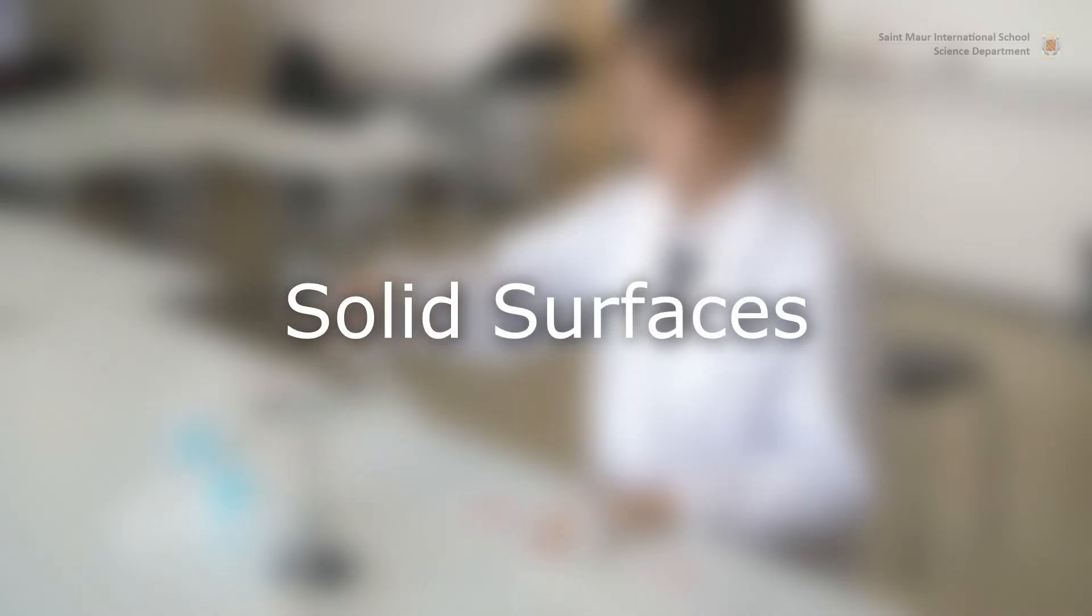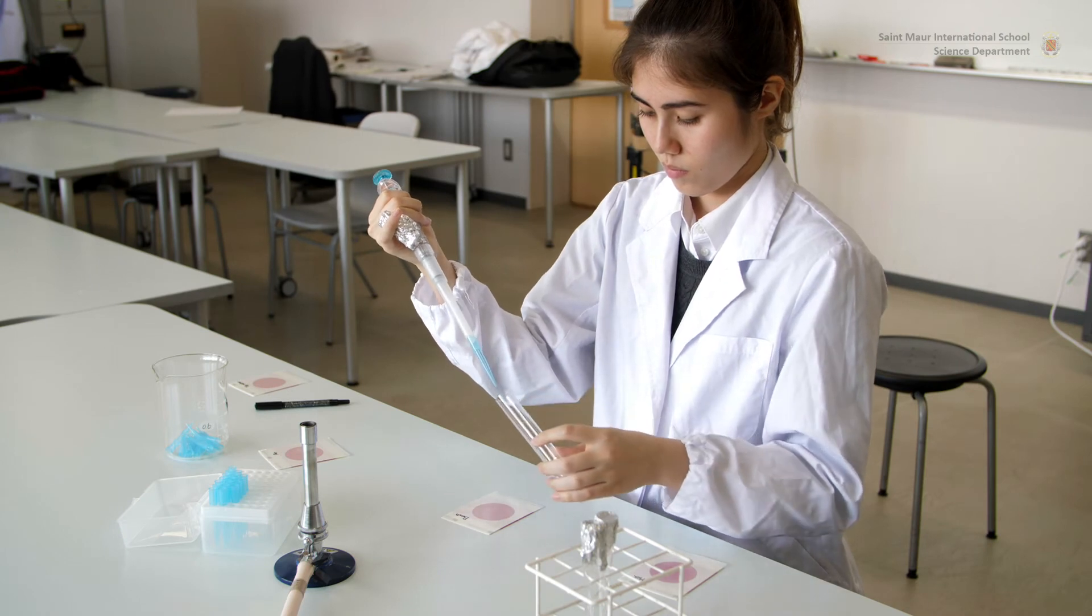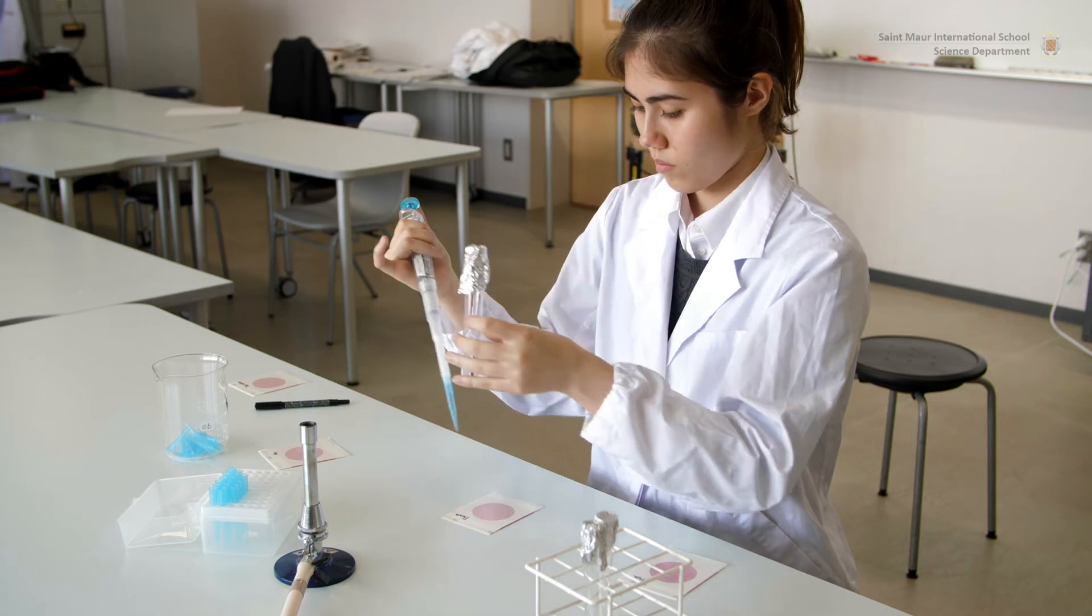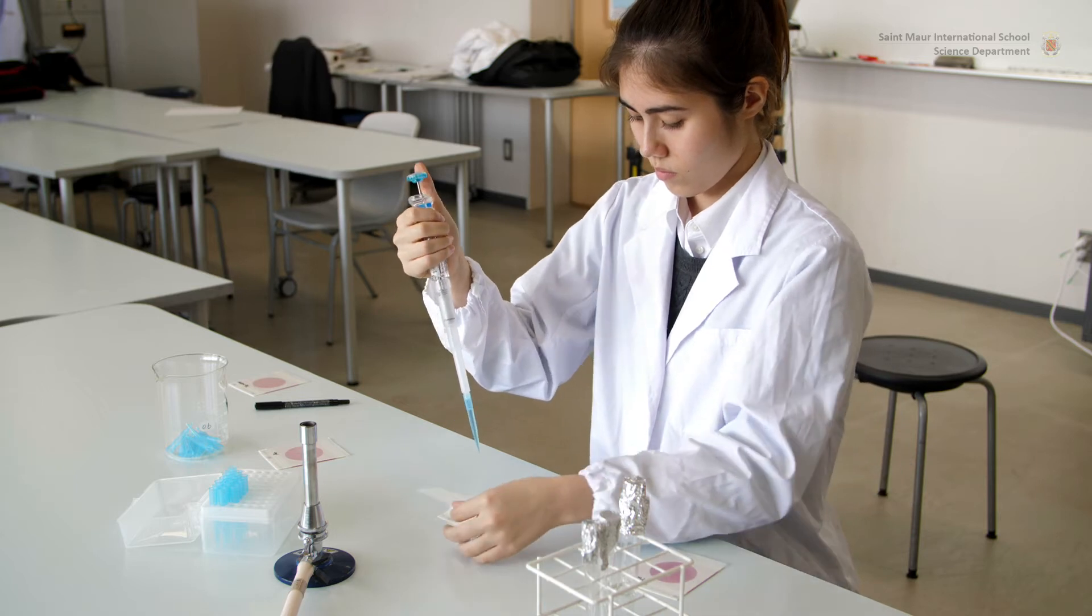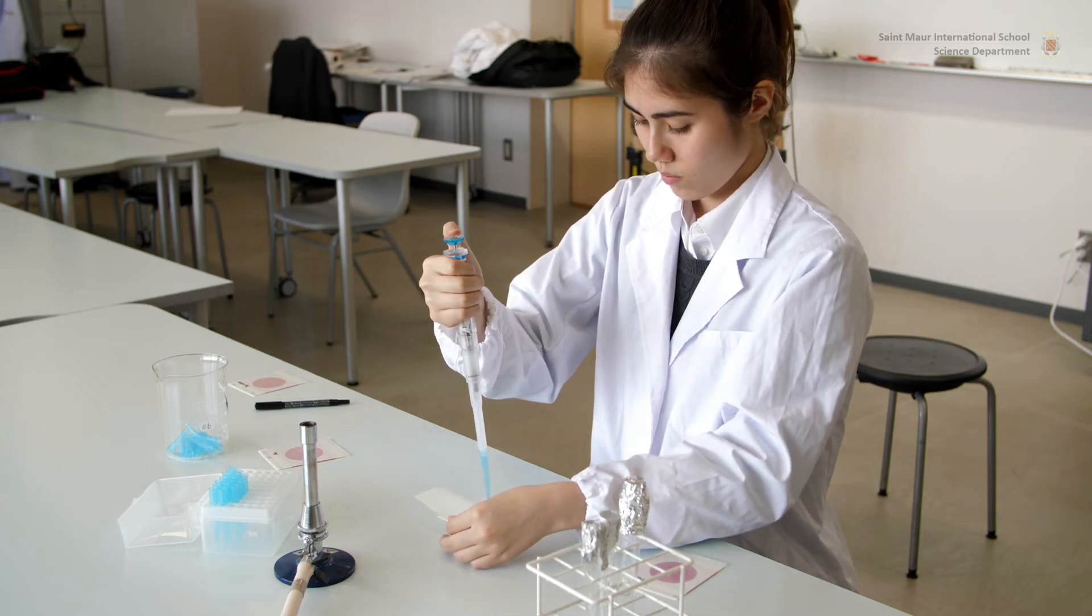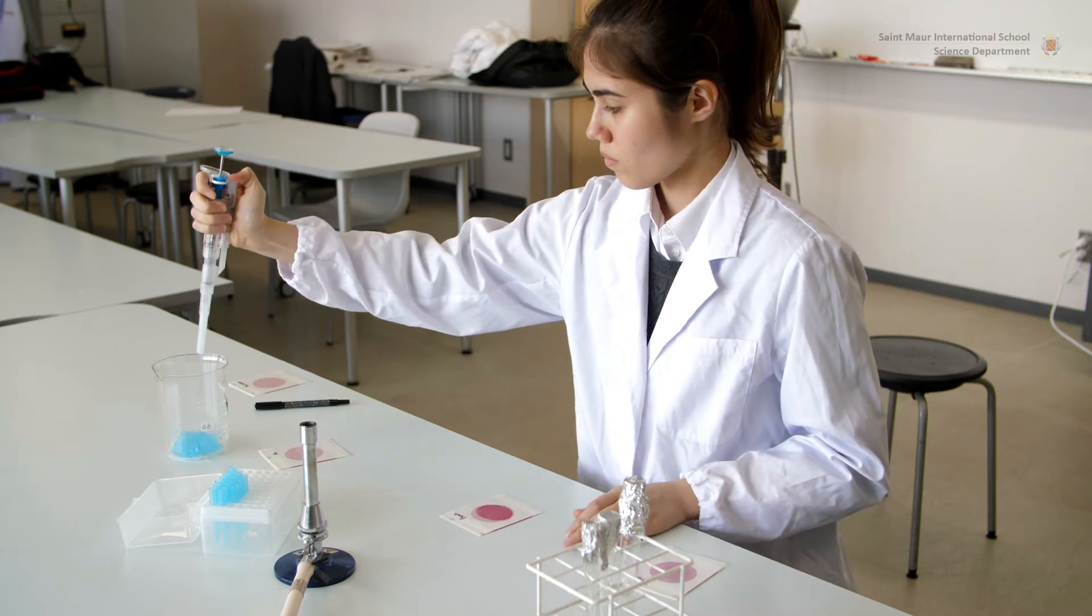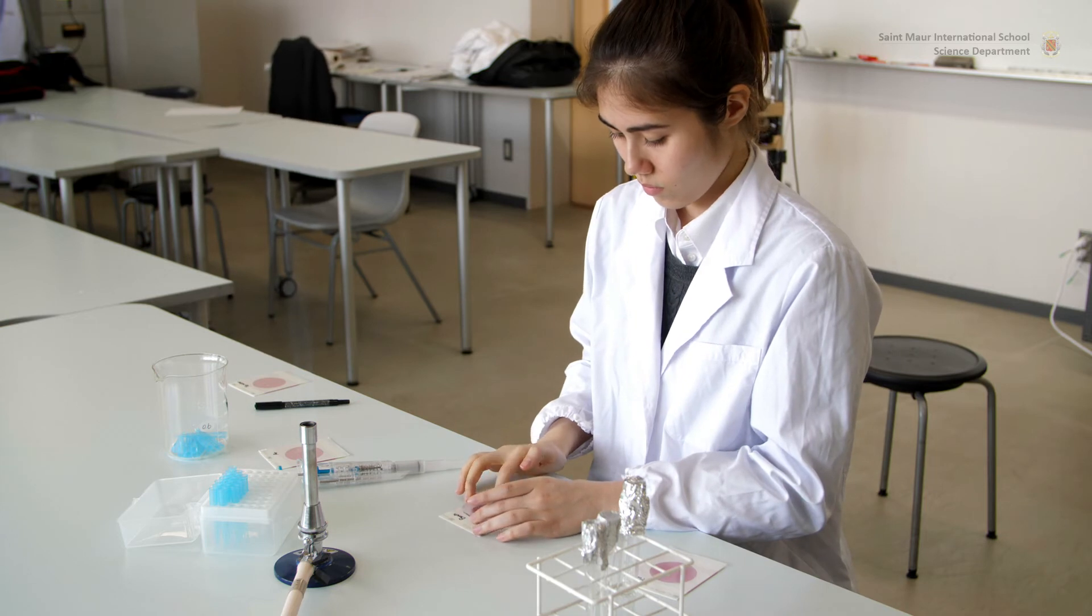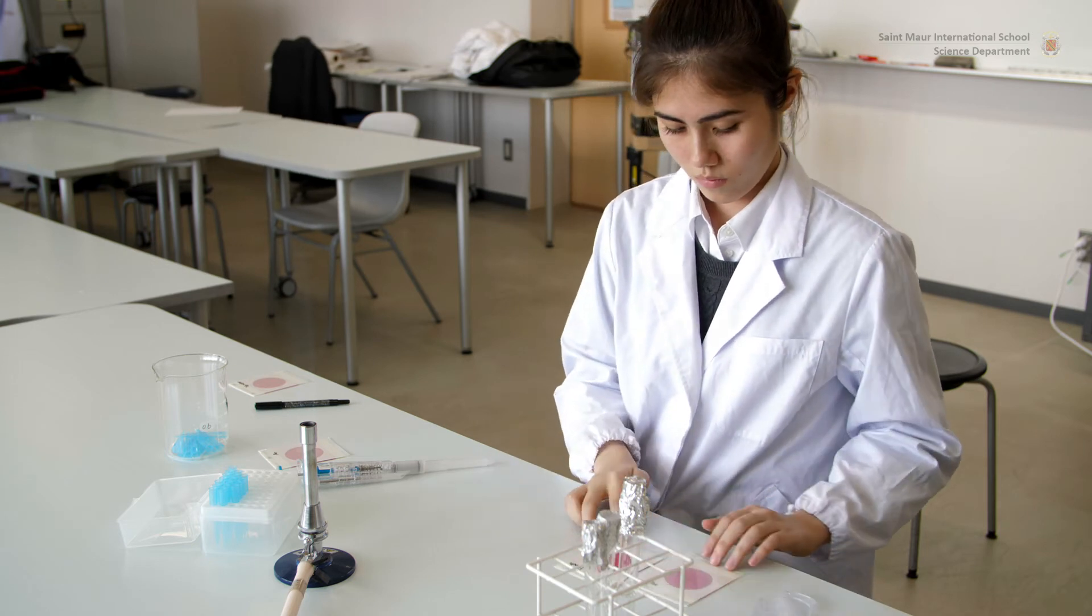Microbial Load Estimation on Solid Surfaces: For surface sampling, the petrofilm must first be jellified by adding 1 milliliter of an 8.5 gram per liter sodium chloride solution that has previously been sterilized by autoclaving. The petrofilm is left to jellify for 1 hour at room temperature.